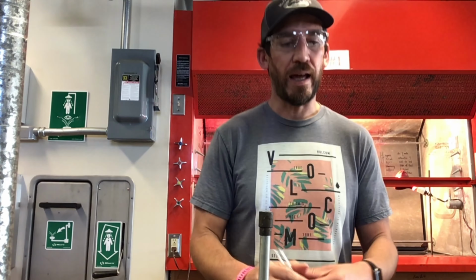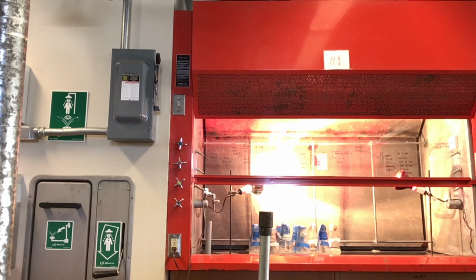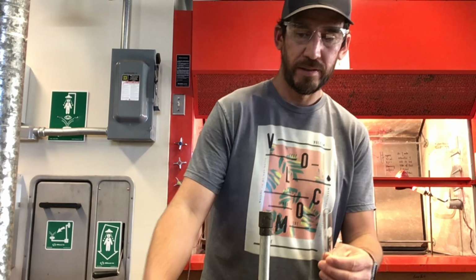Okay, so that was a liquid. Super easy to do. I didn't leave. You never leave your Bunsen burner unattended. I was still here. Y'all just couldn't see me.